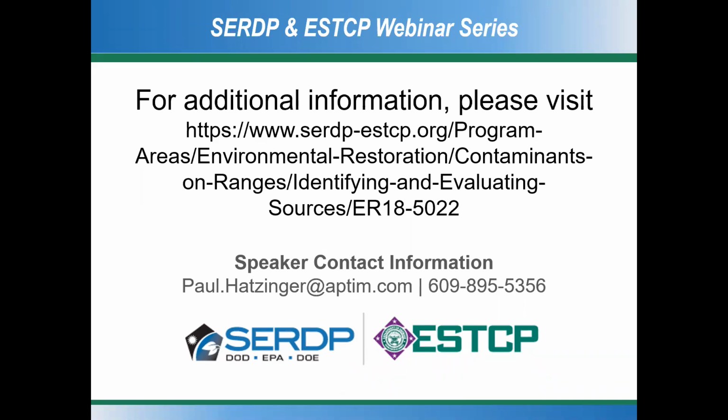A second part of it might be regulatory acceptance. So people like John Wilson, scientists within EPA, have been beating this drum for a long time. But it's really getting through to the regulatory community as well, because the problem with some of it is that there's not established EPA methods. So it's not like 8260 where you have to follow this exact procedure.